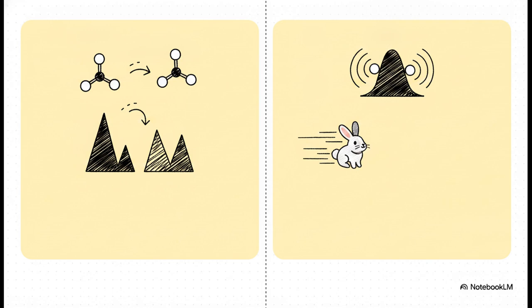In molecules like acetylacetone, the conversion between the keto form and the enol form is actually quite slow on the NMR timescale. Because it's slow, our camera easily captures both forms at the same time. You literally get the spectrum of the enol form superimposed directly on top of the spectrum of the keto form, and you can even calculate the equilibrium ratio just based on the peak sizes.